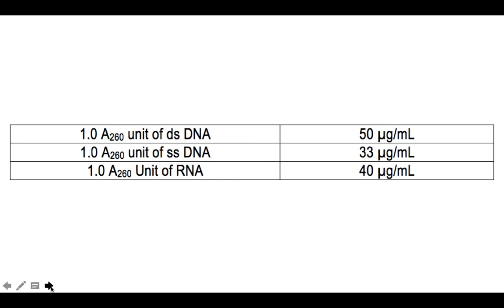So you of course expect absorbance readings. For this, we can simply refer to this table of accepted conversion values. If we are seeking to determine the unknown concentration of our diluted DNA sample, which is what we really want to do, this information would be very helpful.